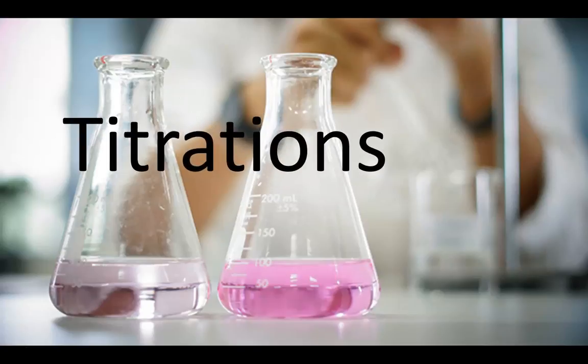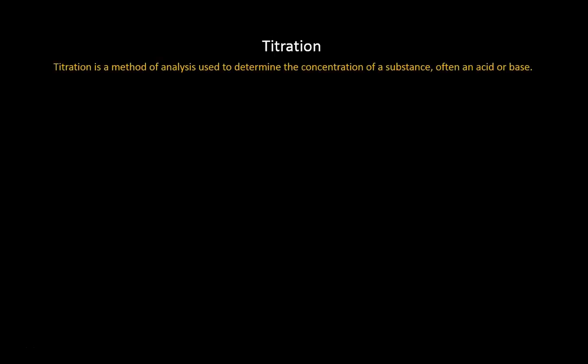Titrations in practice. Titration is a method of analysis used to determine the concentration of a substance, often an acid or base.